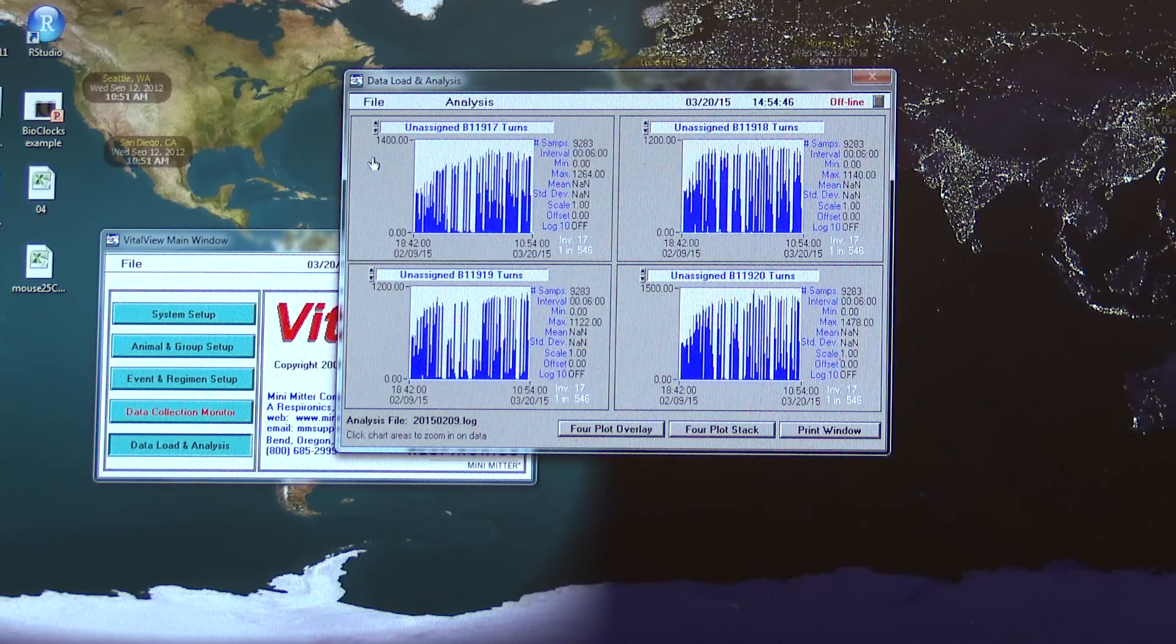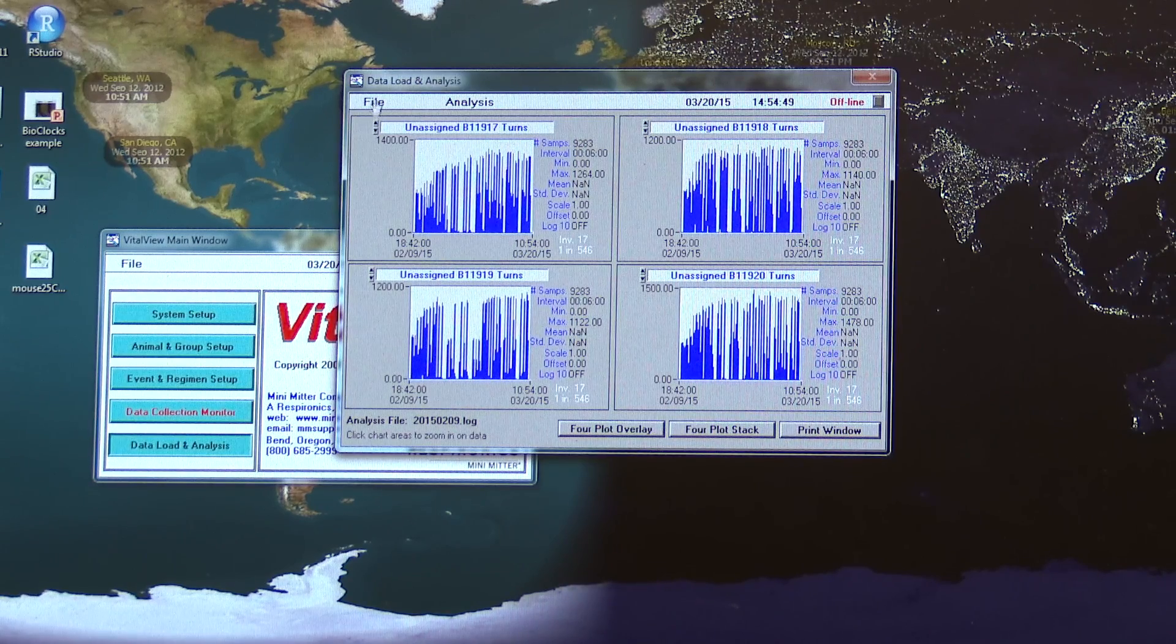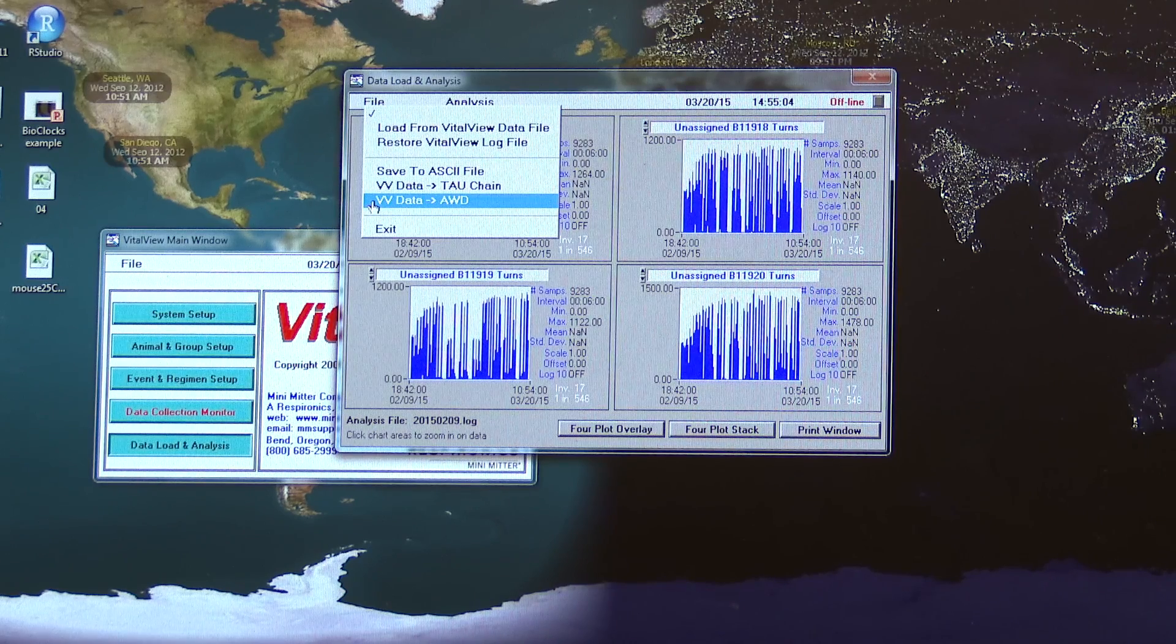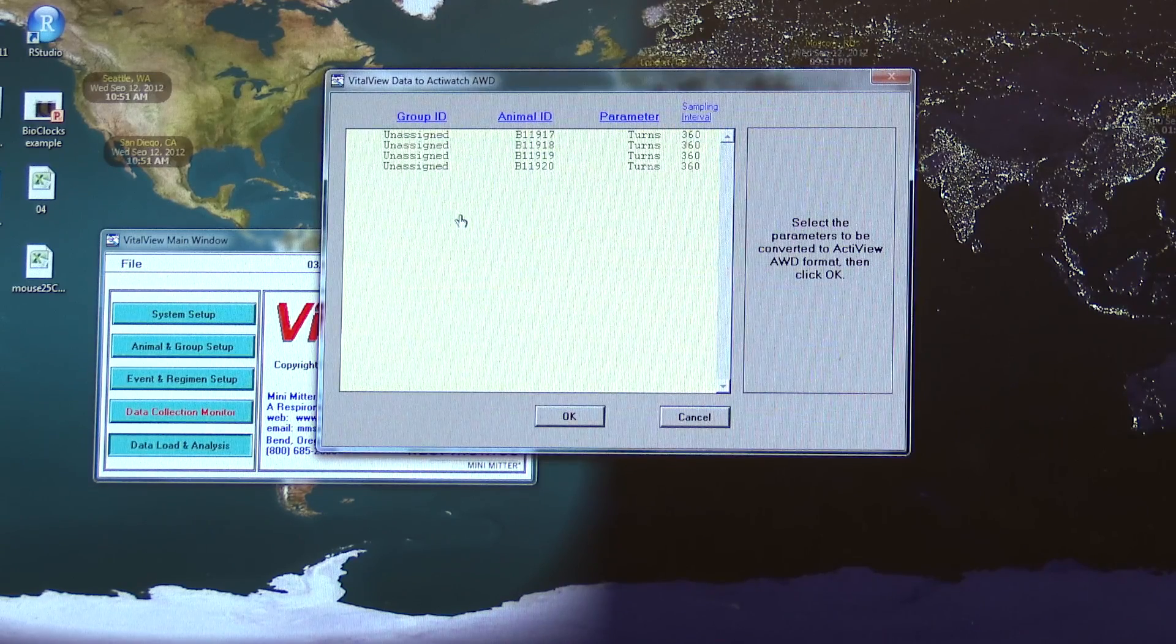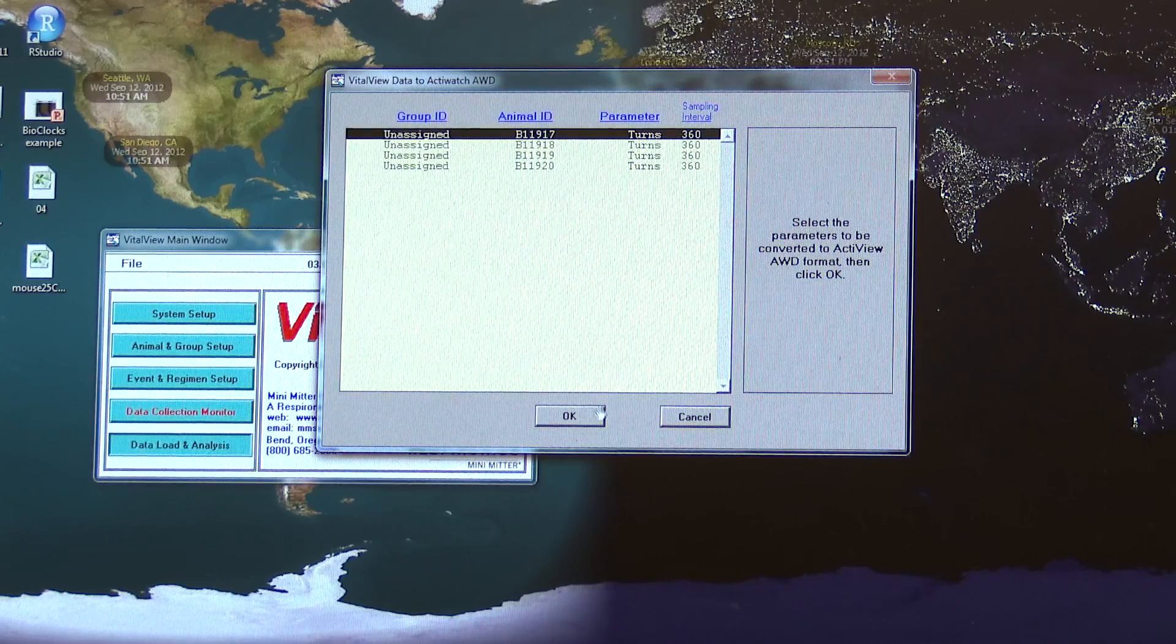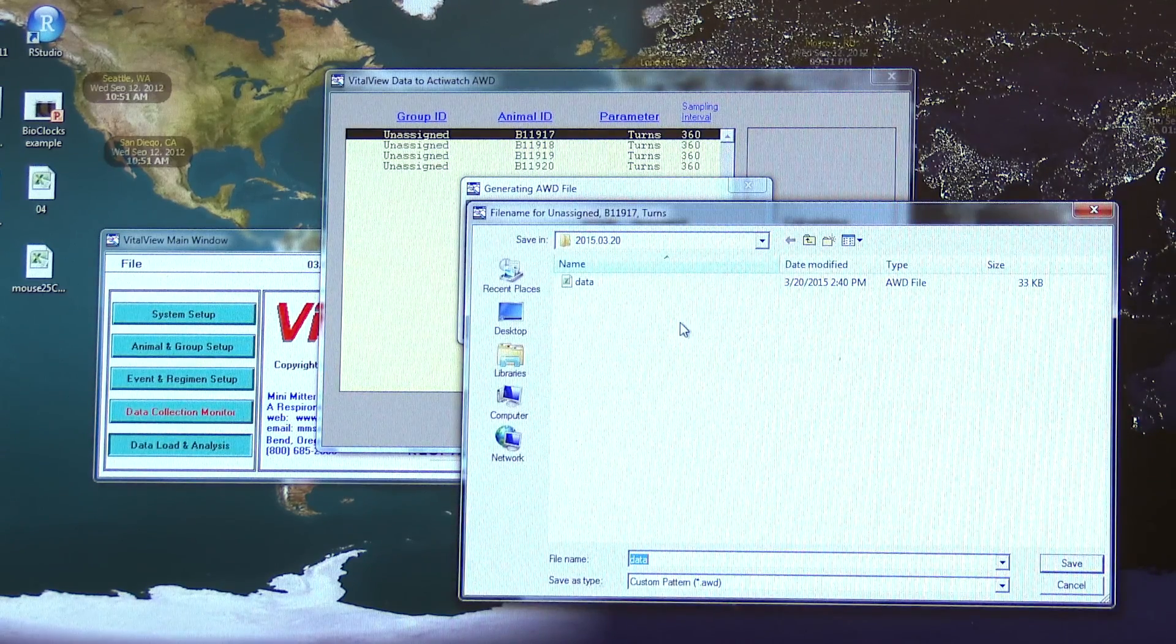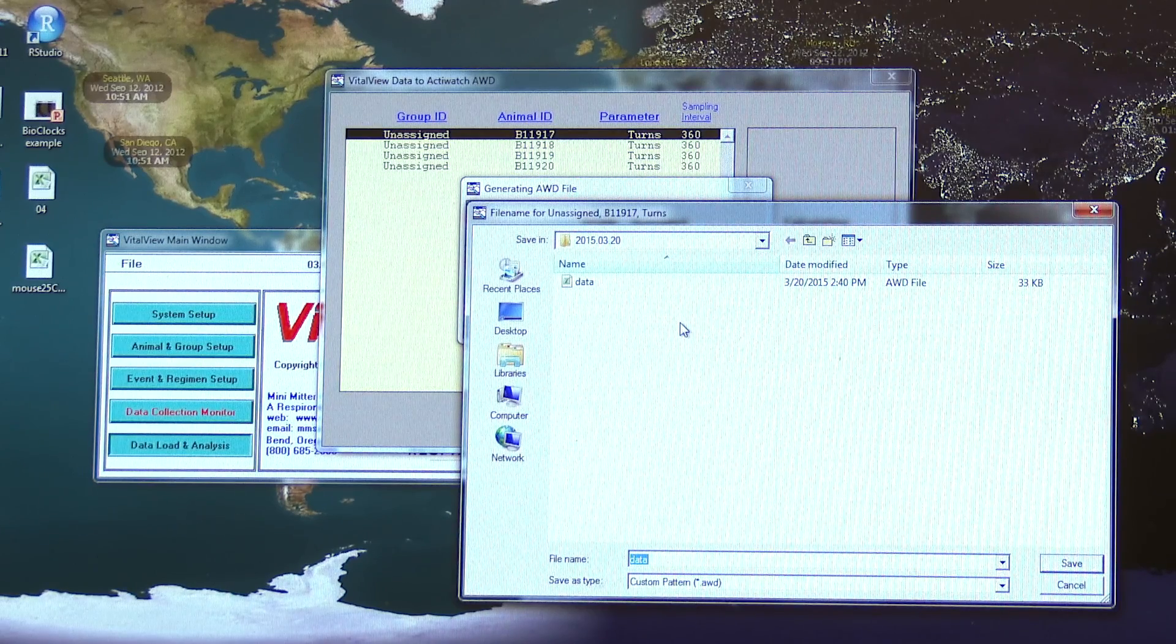In order to look at this in ClockLab, I'm going to have to make it into an AWD. I do that by going to file and then convert VitalView data to AWD. It'll let me select from the animals I've already selected and click OK, and then it prompts me to save them wherever I want. I'll usually do that in the folder for the experiment I'm running.